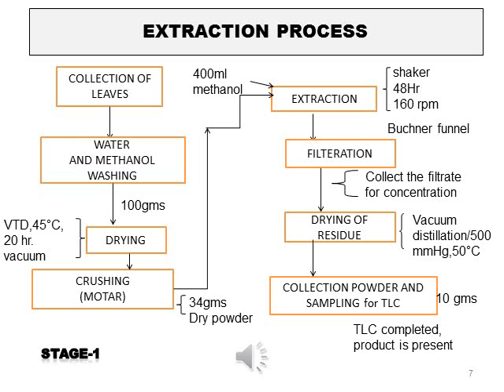Then we fed it through filtration and drying. After getting the dried powder, we went to stage 2. Before stage 2, we did TLC sampling to confirm whether the constituents are present or not. We obtained the result as completed. TLC is completed. The product is present.